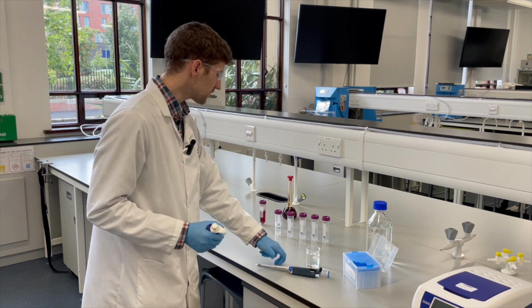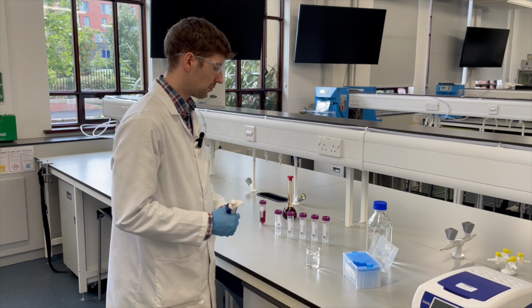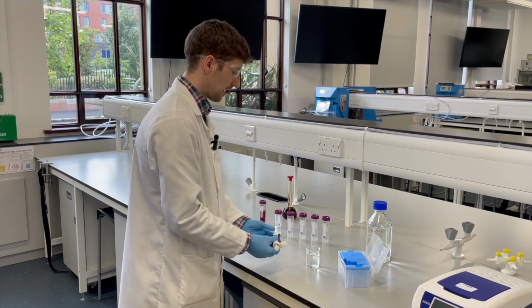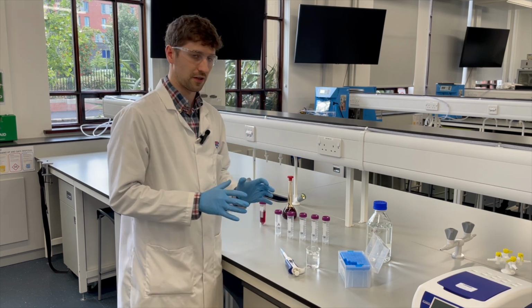Okay, so we understand how to use a pipette, we understand what we have and what we need. Let's get cracking, okay? All right, so I'm just going to place a pipette tip on, and I'm going to get started, all right?